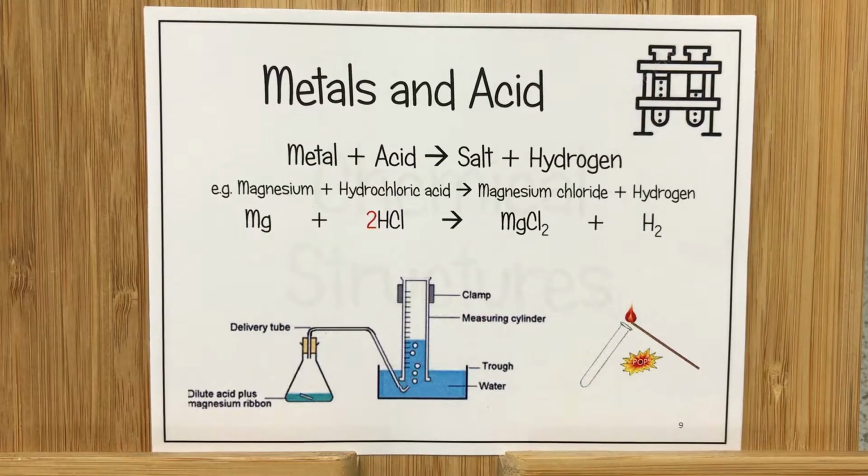Okay, and that hydrogen can be tested using a lit splint and you get a squeaky pop. Okay, so hopefully we should get a good squeaky pop from our reaction.